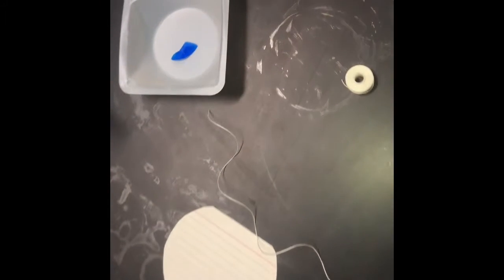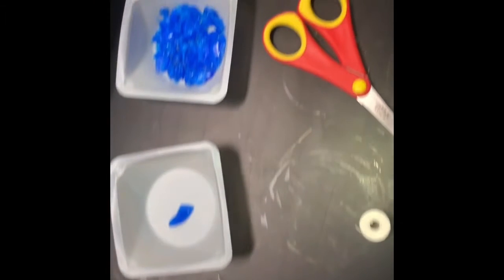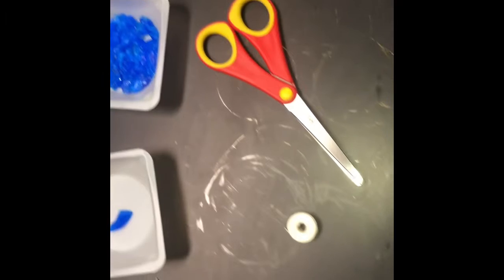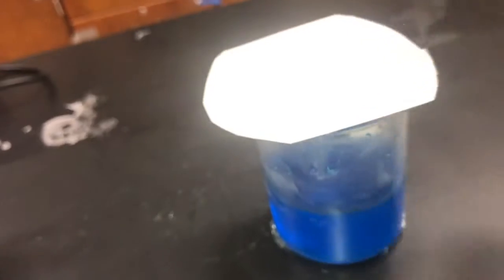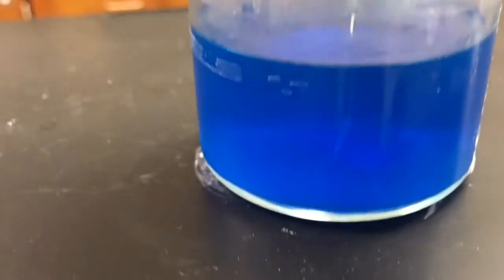While your growing solution is cooling off, tie your seed crystal onto one end of a thread, then loop the other end of that thread through an index card. Then place that index card on top of your beaker with the seed crystal hanging at least an inch above the bottom. Once that is done, place a lid on top of your beaker, allowing your crystal between a couple of days to weeks to grow.